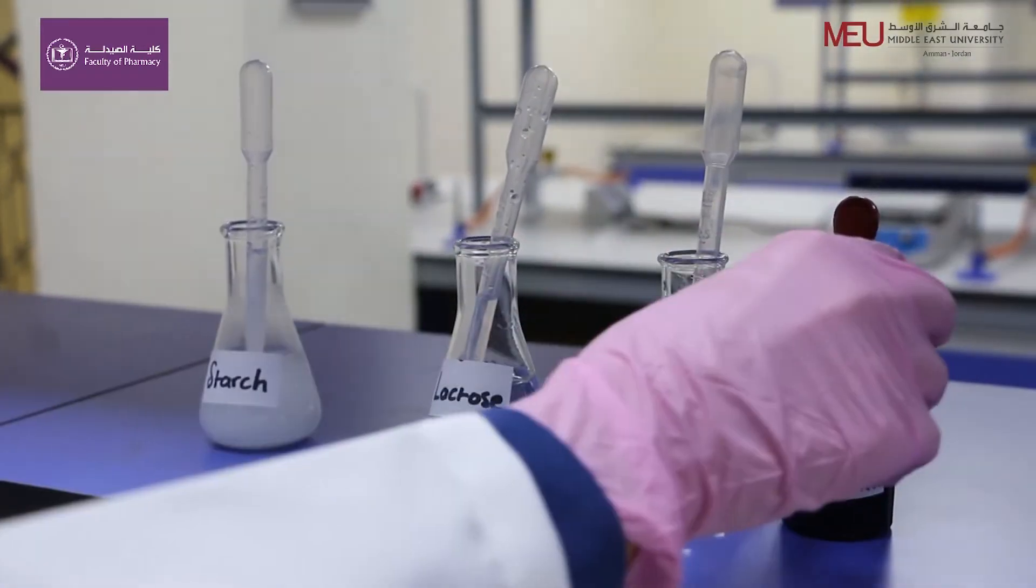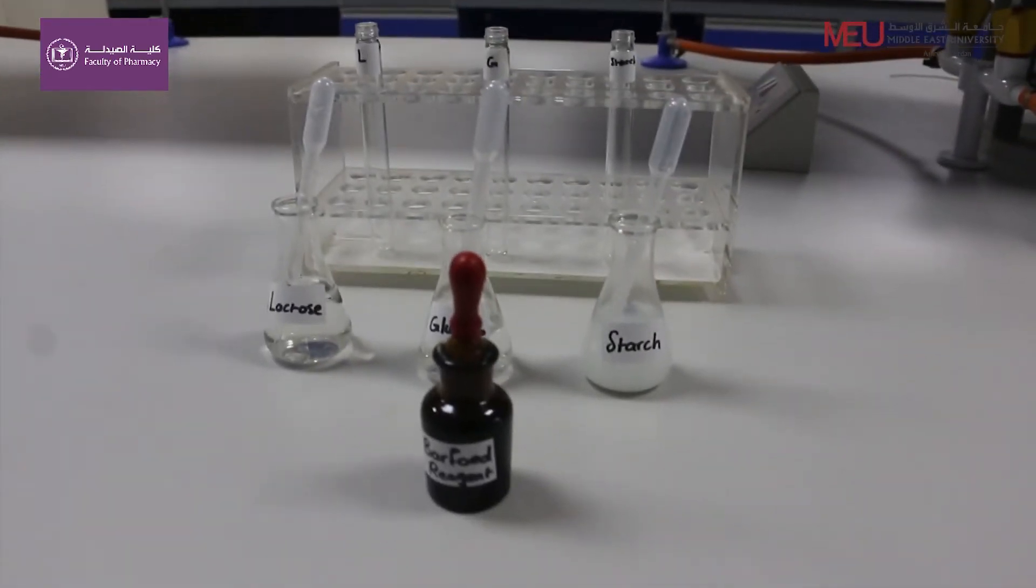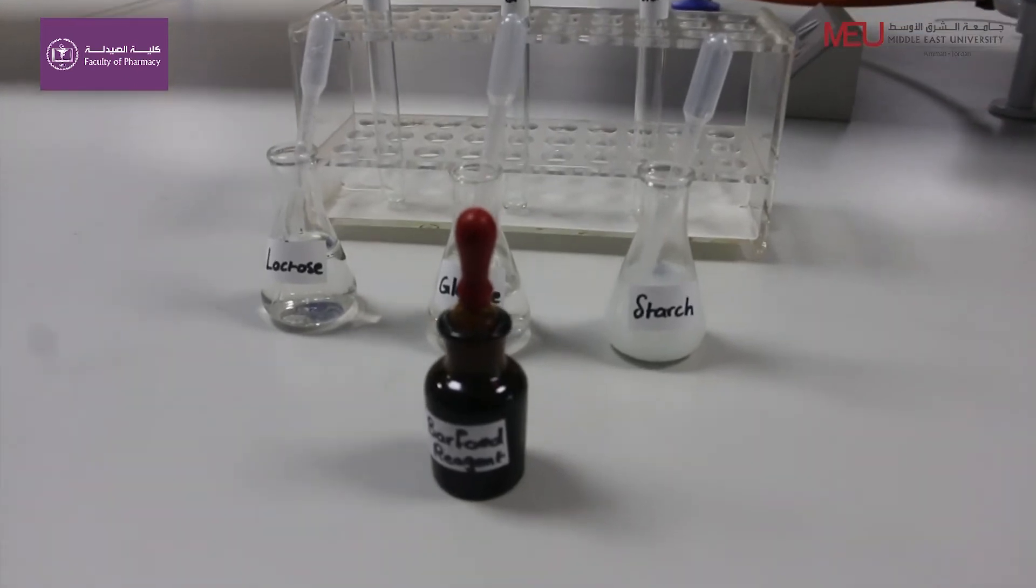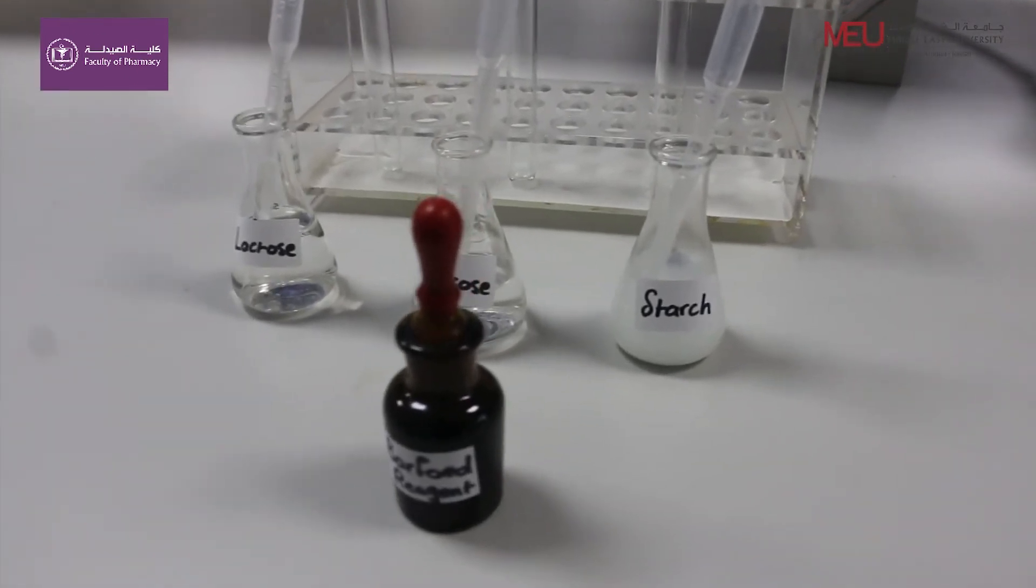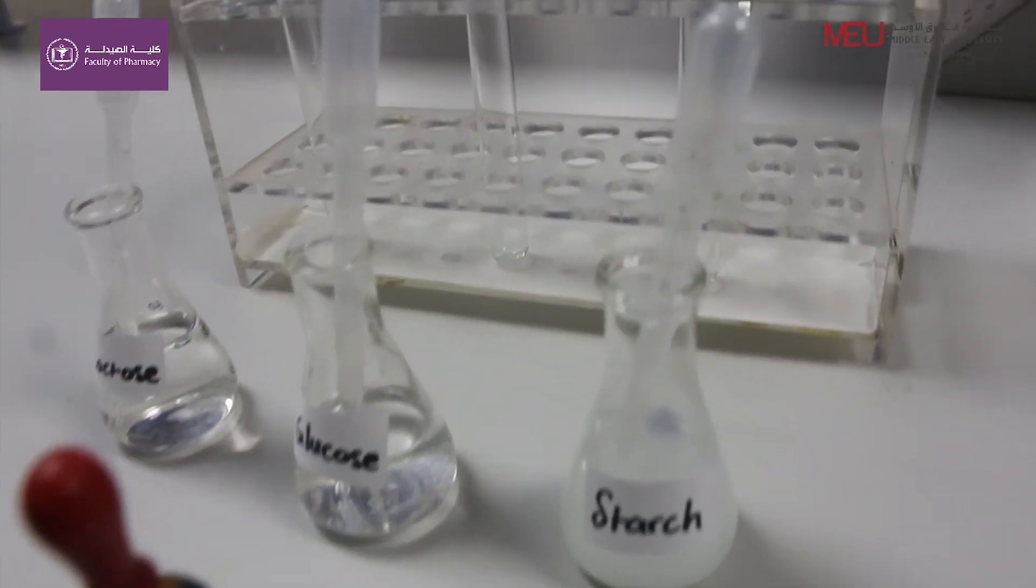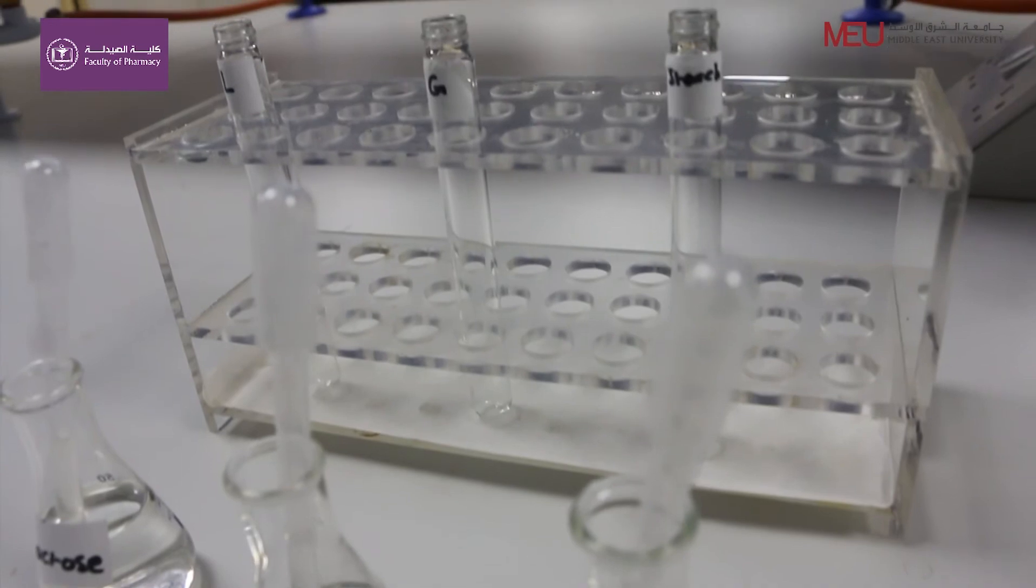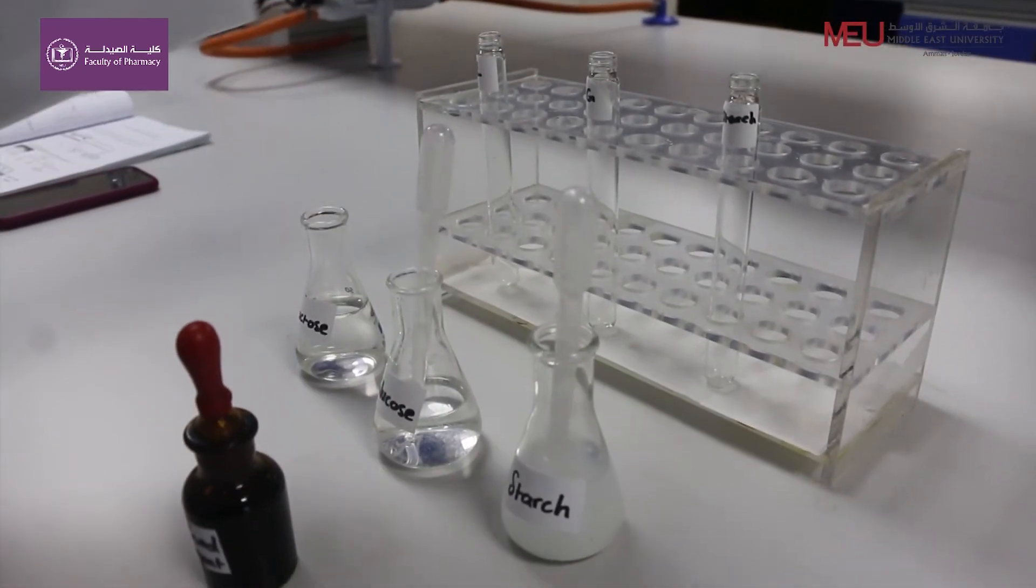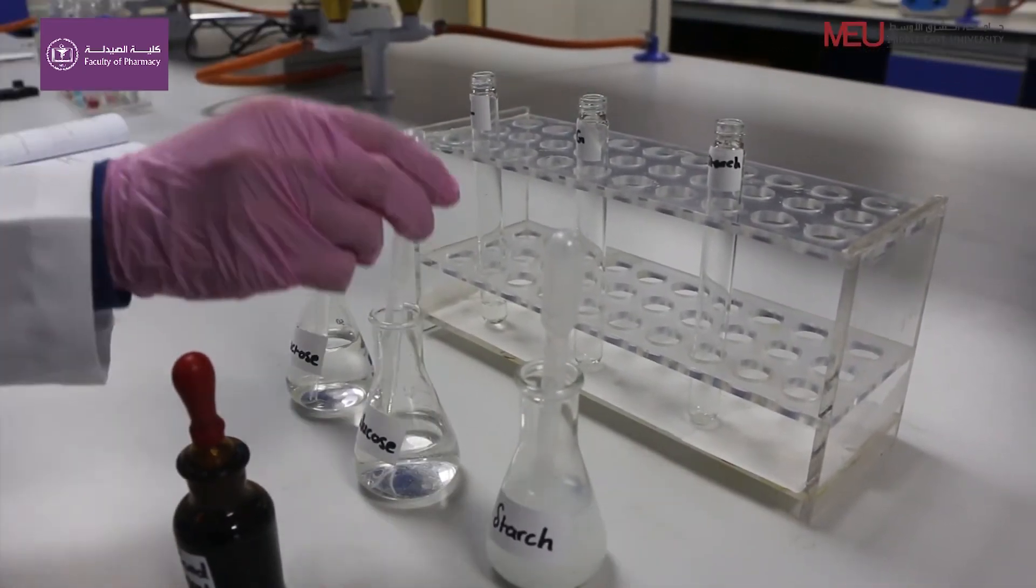Barfoed's test. Barfoed's test is used to distinguish monosaccharides from disaccharides by speed of formation of the red complex which is faster in monosaccharides. Add 3 ml of Barfoed's reagent to their separate test tubes.